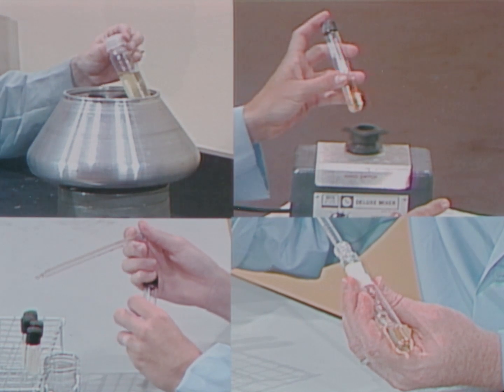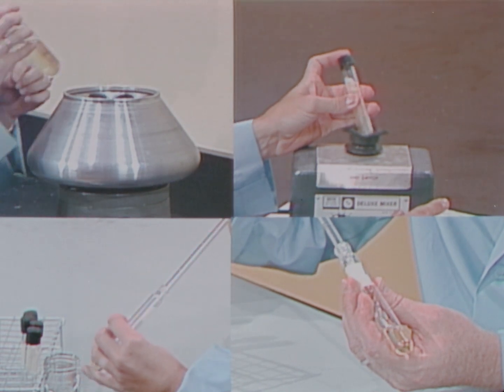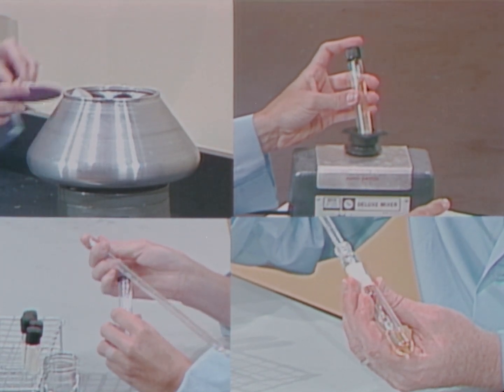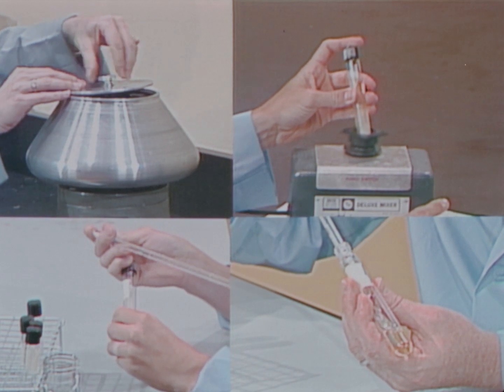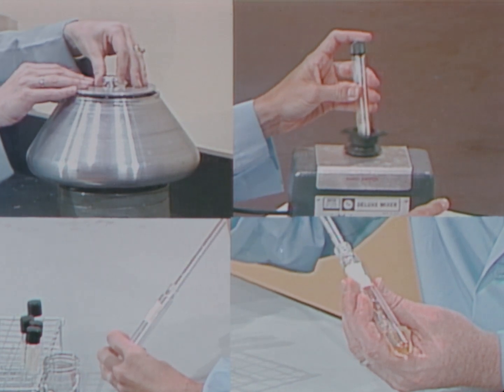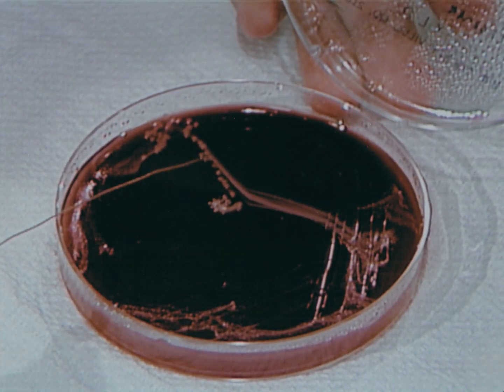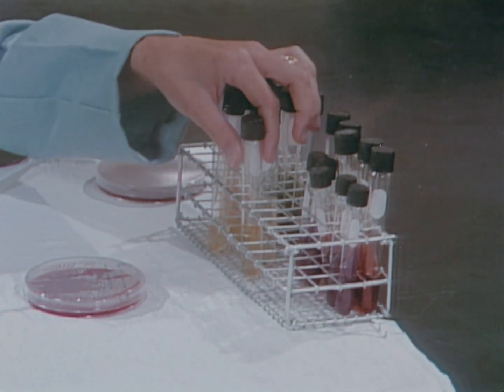We have examined the formation of droplet nuclei in procedures performed with common laboratory equipment. Some procedures generate large droplets larger than 5 microns. These particles are airborne for a short time and then settle on the skin and bench tops. These large droplets usually cannot penetrate beyond the tracheobronchial tree. Surface contamination can result from separating the halves of a petri dish. A moisture film may form between two contact points. When the film is broken, aerosol droplets develop.